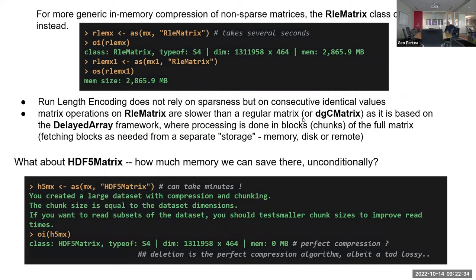For more generic cases, we also have the option to use RLE matrix — run-length encoding. It works when the data is not sparse but still has repeated consecutive values. After the transformation of adding one, instead of zeros you have runs of ones, and those are compressed. However, the compression is not as good — it's slightly larger than DGCMatrix for sparse data, but at least it's consistent. For zero or non-zero values, the same compression applies.